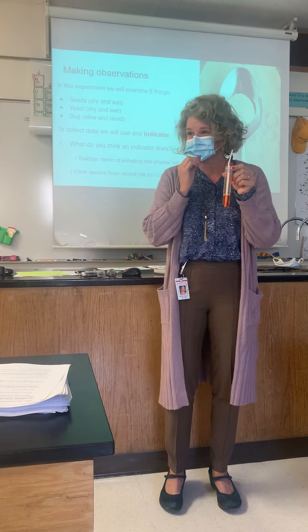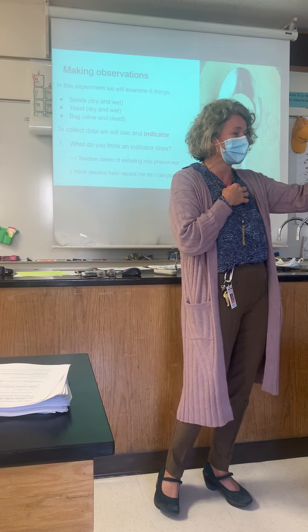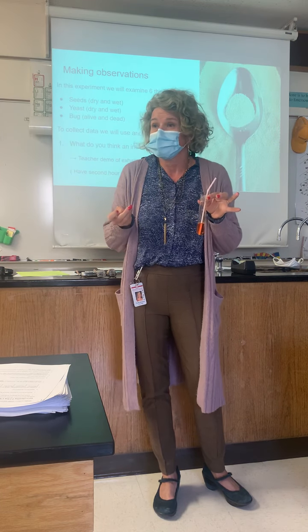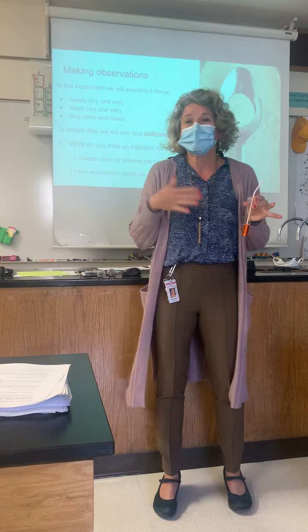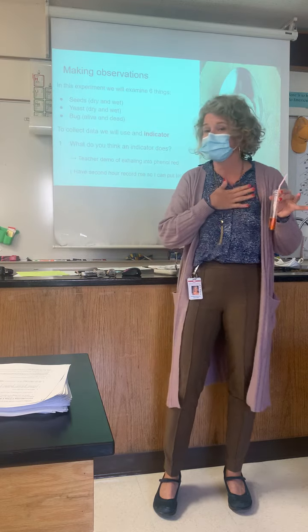I got pretty good lung capacity, don't I? Woo! What did you guys notice? It changed color, okay? That's what indicators do, all right? They're not magic, it's chemistry. So indicators indicate changes in pH. Most of the time, that's what they're indicating.